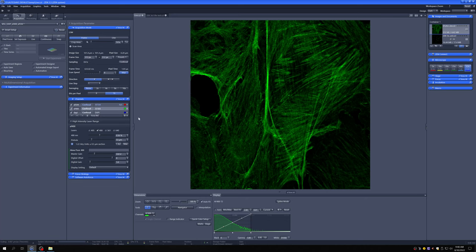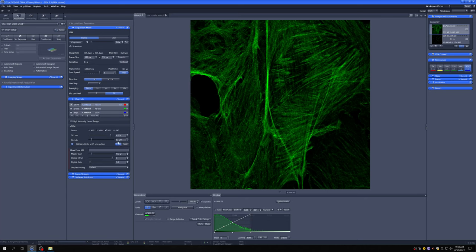When we switched from 20x to 63x, the pinhole size is different. I had to go again to the longest wavelength fluorophore, hit 1AU. If you recall, this was a different number before. Now it's 53 microns. I did that, and then I fiddled a little bit with the master gain to make sure there were no saturated pixels.